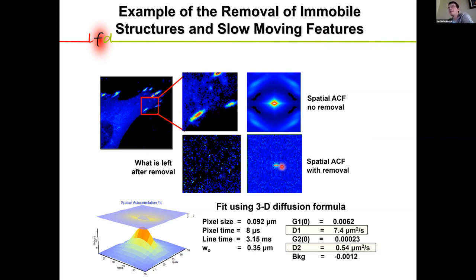And what we were left with was only the autocorrelation functions of the molecules that are moving around those focal adhesions.